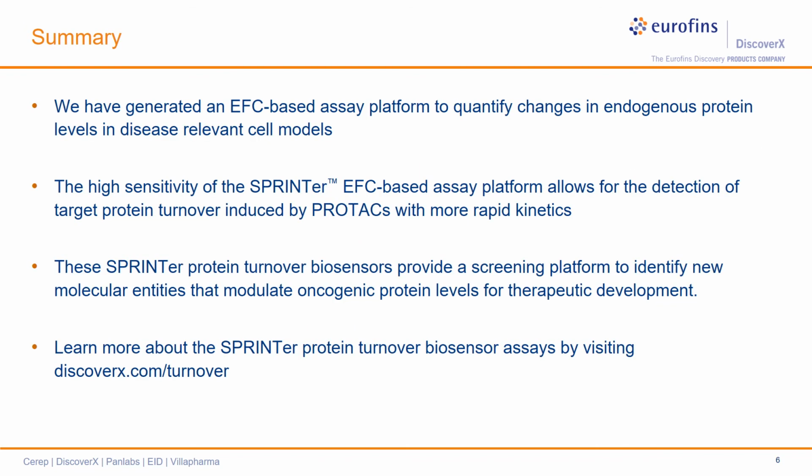In summary, we have developed a simple and homogeneous cell-based assay platform for screening protein degraders in a high-throughput manner.